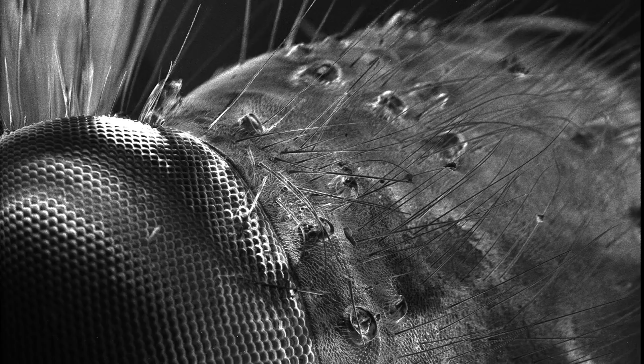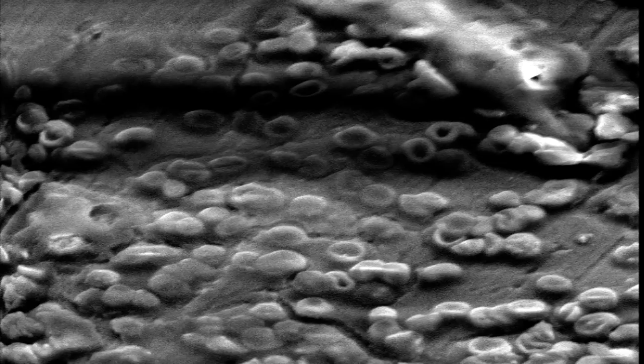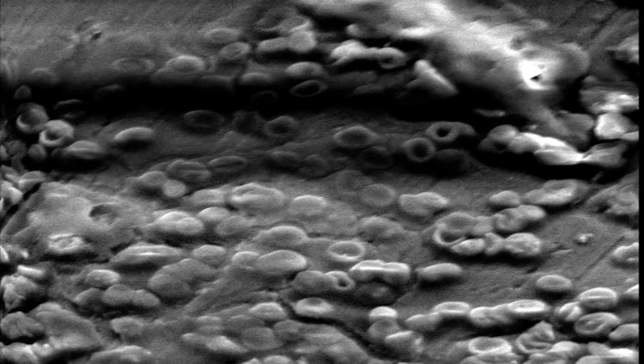I was also able to capture an image of red blood cells. This is just a tiny drop of blood that I put onto a metal holder. And the blood cells are drying out but aren't completely dry yet. I was kind of surprised how much signal I got out of this.